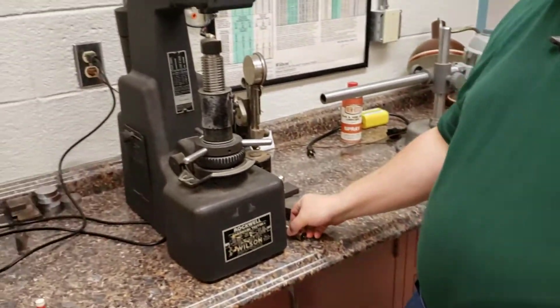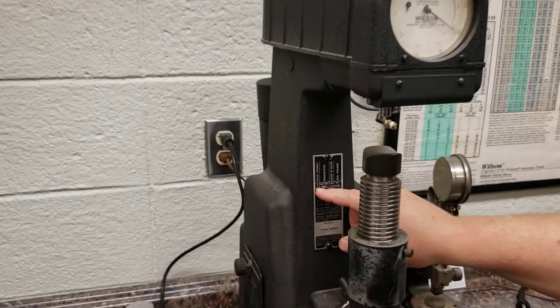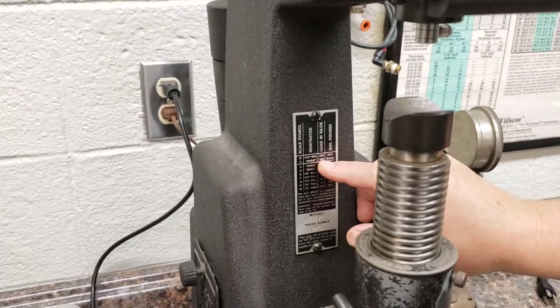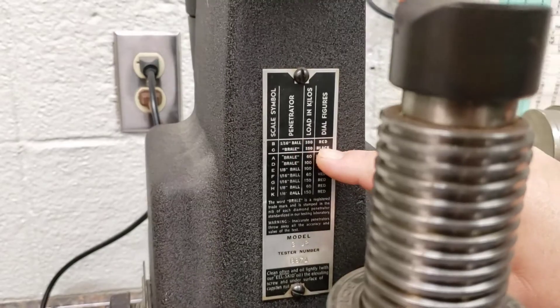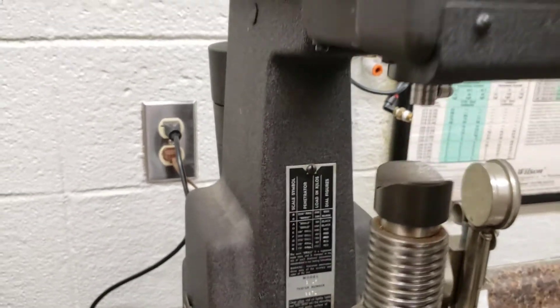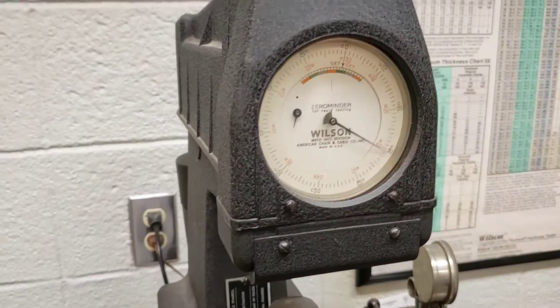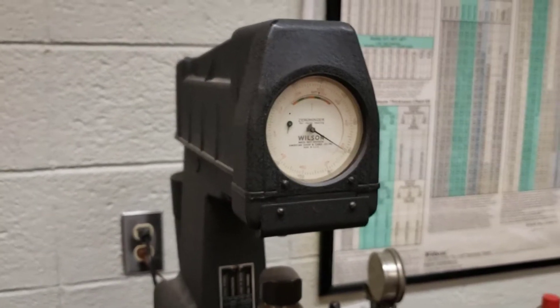I'm going to use the C scale. Just like the other tester, it tells you what the settings are. The C scale uses a Brale indenter, has a 150-kilogram load, and you use the black dial. You'll see I have both black and red sets of numbers, and it tells me for the C test I need to use the black numbers.